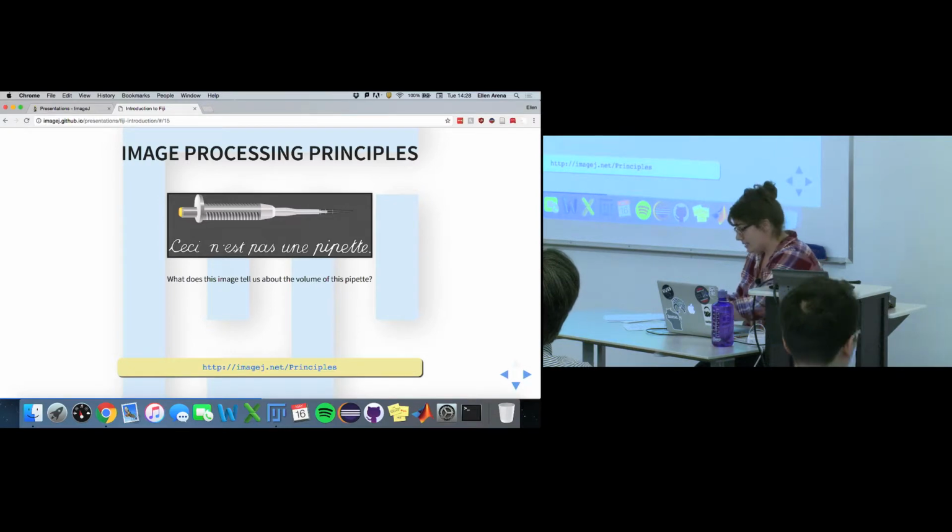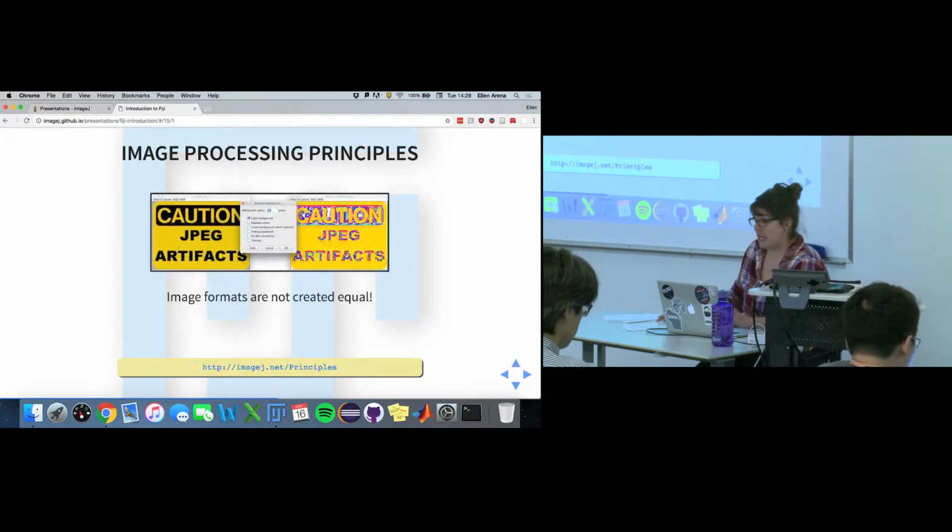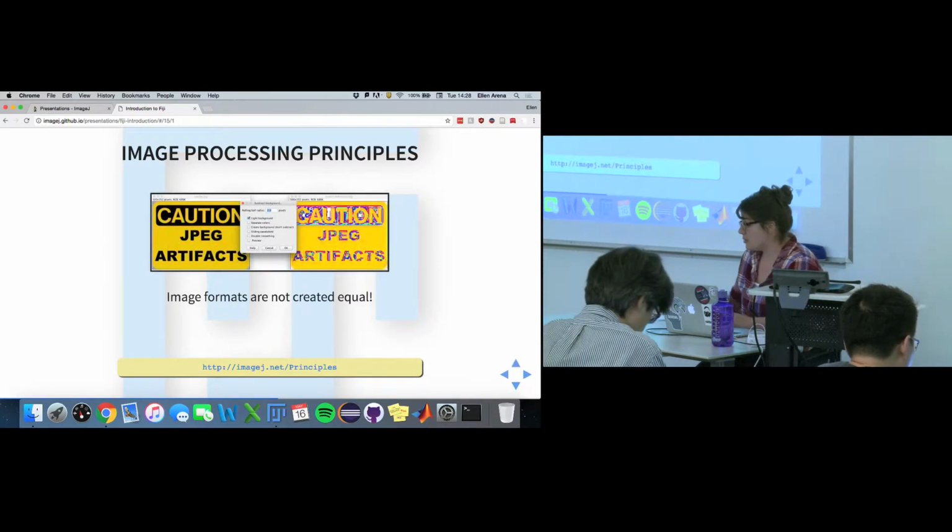So saying that, not all image file formats are created equal, okay? There are some, most notably JPEG, that can actually corrupt your images. That sounds scary, and it should scare you, because that's exactly what you don't want to do when you're working with your biological data sets. You want to preserve as much information as possible. With JPEG, it's not just a matter of losing information via lossy compression. The values themselves can actually be corrupted.